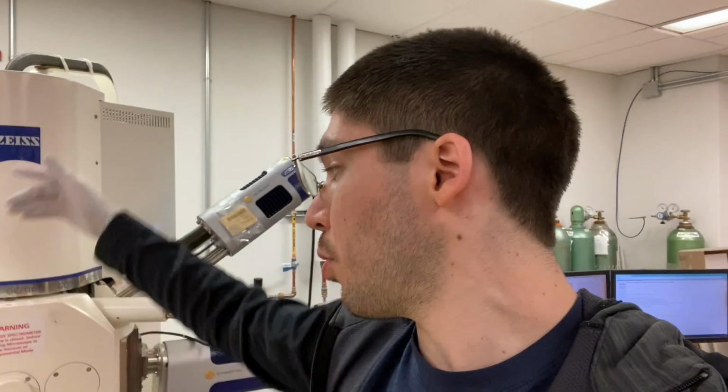For example, when the electron beam interacts with your sample, you can get all sorts of particle interactions, forming X-rays, secondary electrons, and backscattered electrons. And we have all these amazing detectors right here that can each look at a distinct one of those interactions and what you form from those.